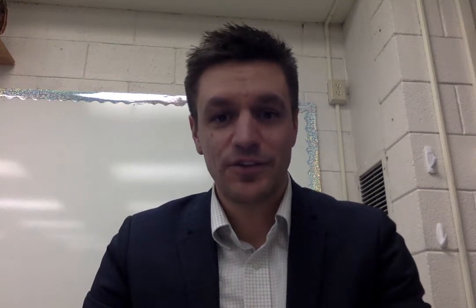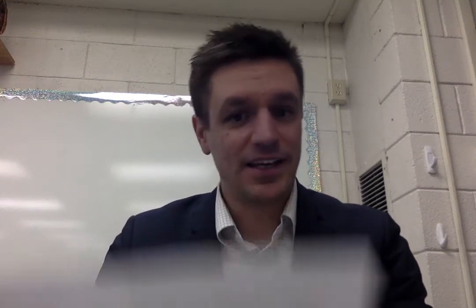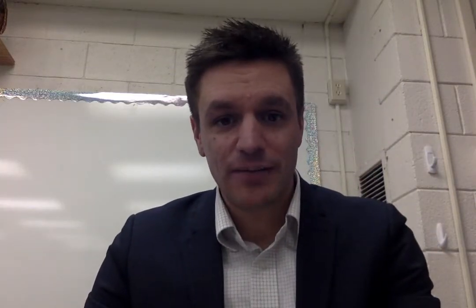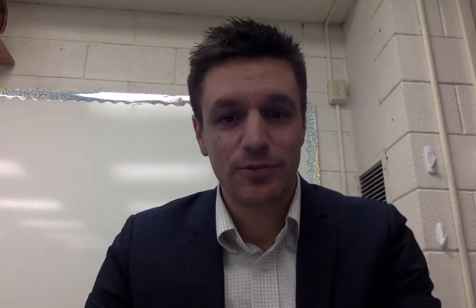Hello, this is the video for the Combustion Reactions Lab. That sheet is right here. I'm going to walk you through the flames that you would do on this lab, and you can take your observations straight from this video.